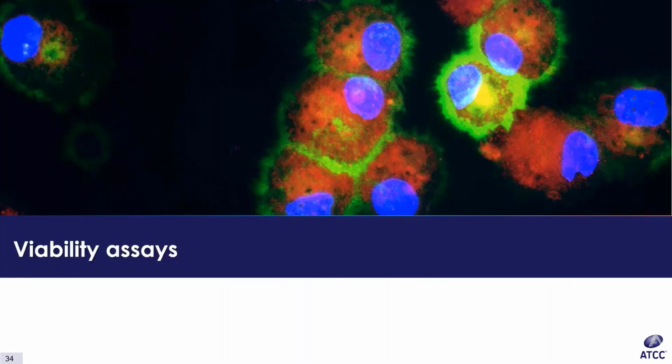And so now we're going to move to the last major topic of this discussion, and this is going to be viability assays.